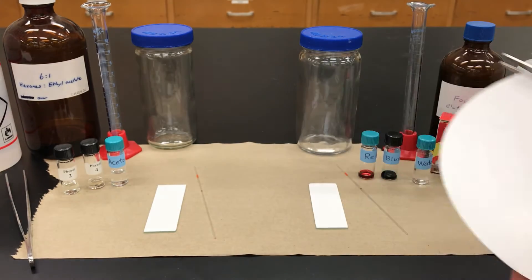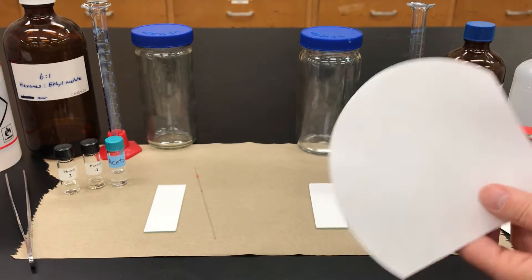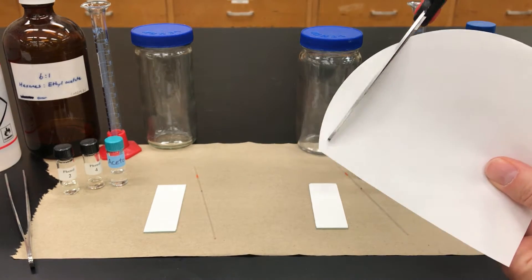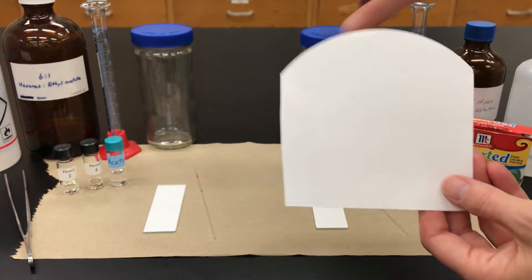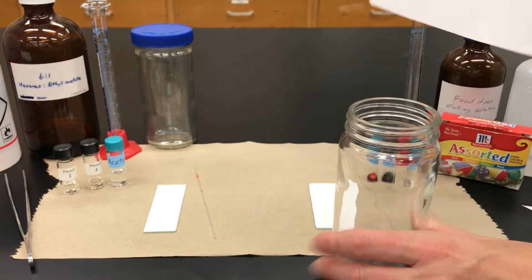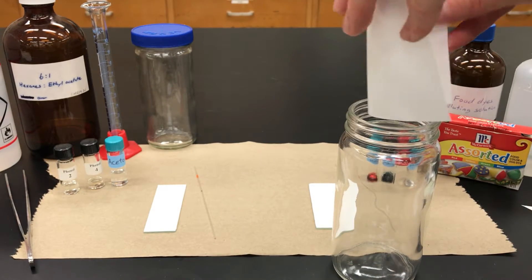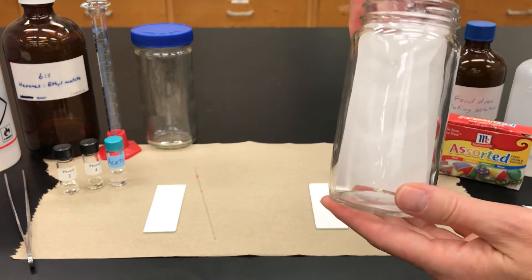I'm going to first start by setting up my TLC chamber, which we put a piece of filter paper in. Take some filter paper and cut it to size, cutting a few of the sides off will help you be able to see better. Stick that inside of a screw cap jar with a lid and push it down to the bottom.